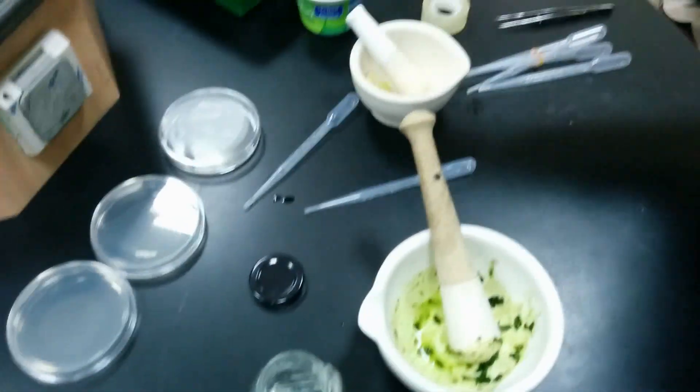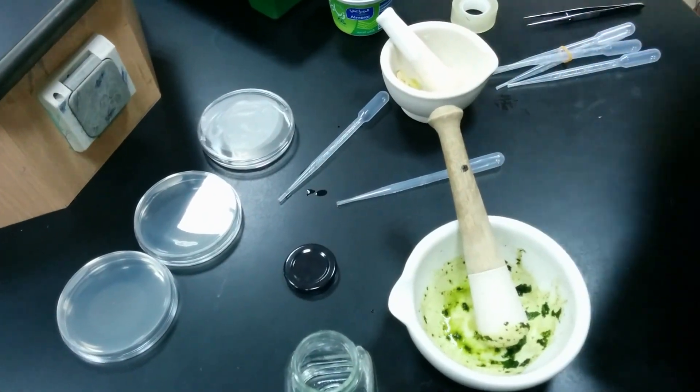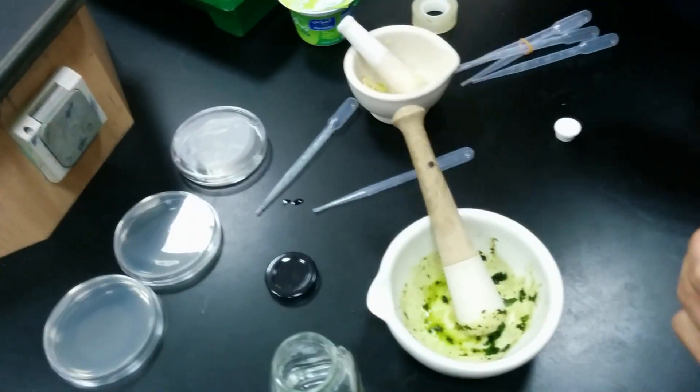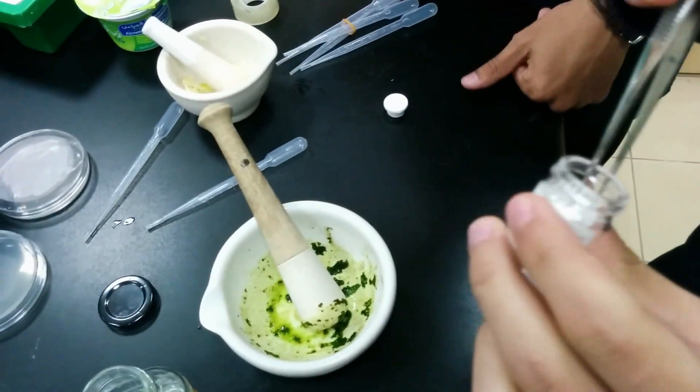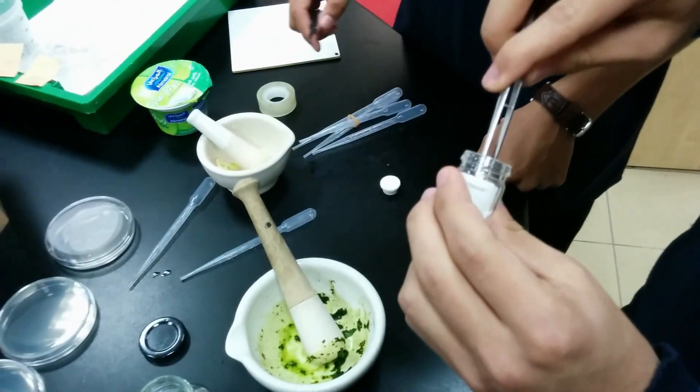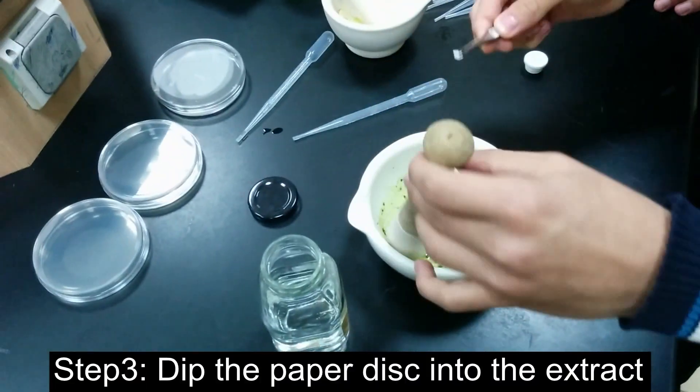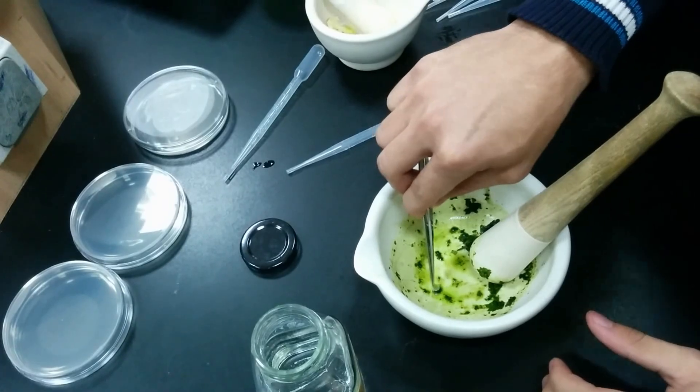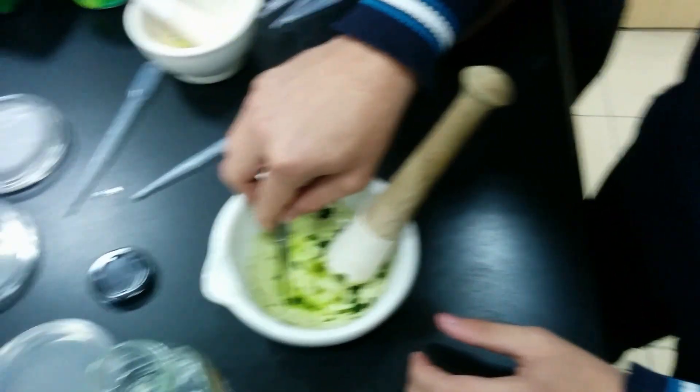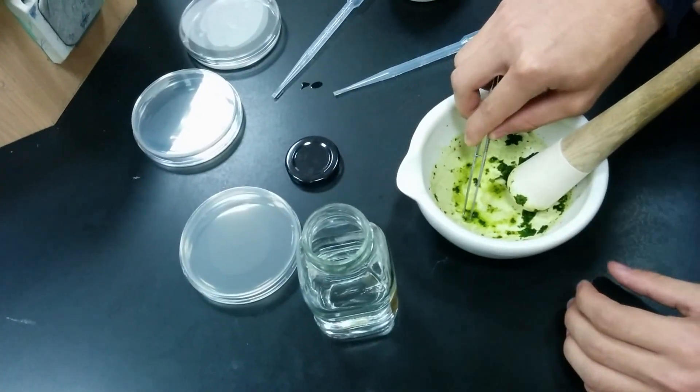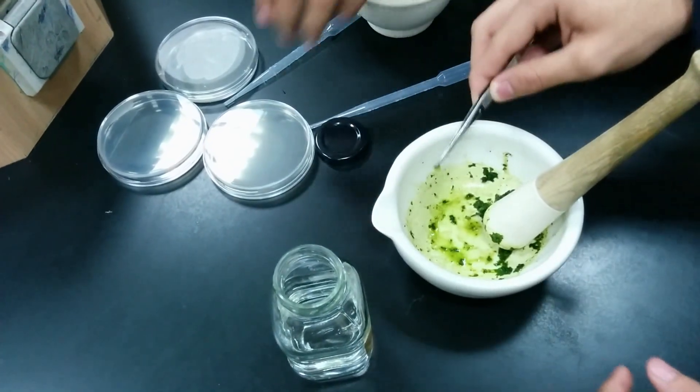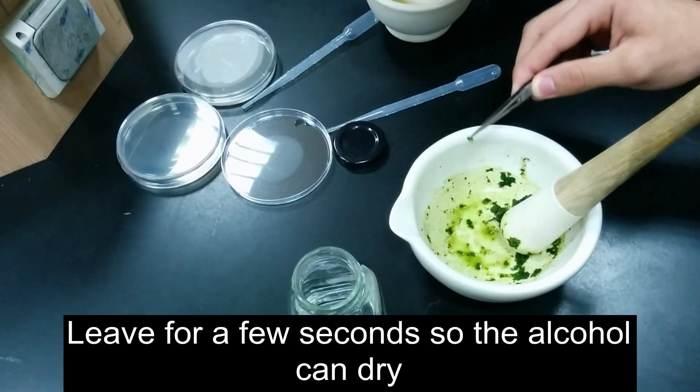Now we're going to use some paper disks. We're going to take one paper disk and dip it into the extract. Now we have to leave it to dry so we can make sure that only mint has the effect.